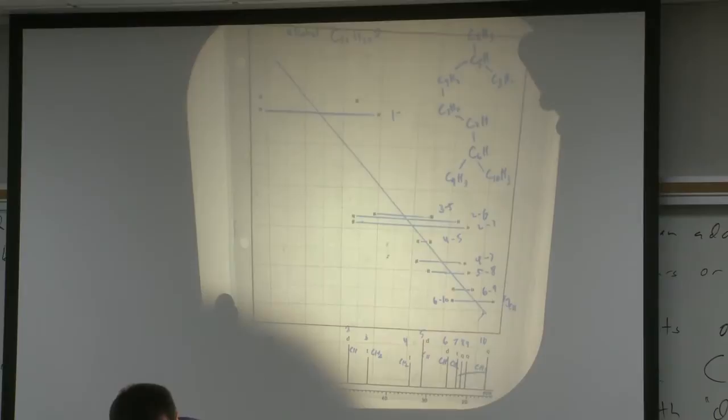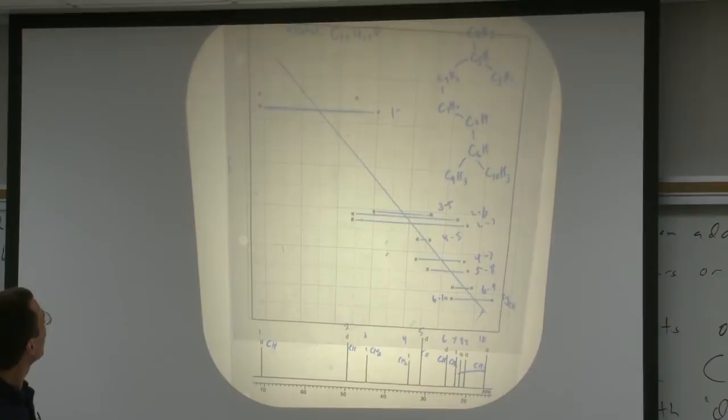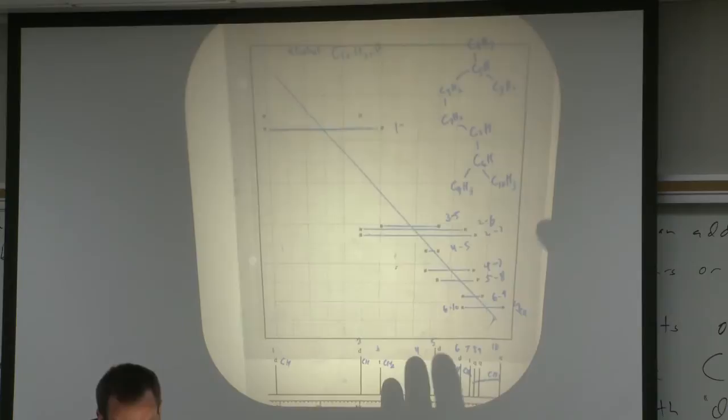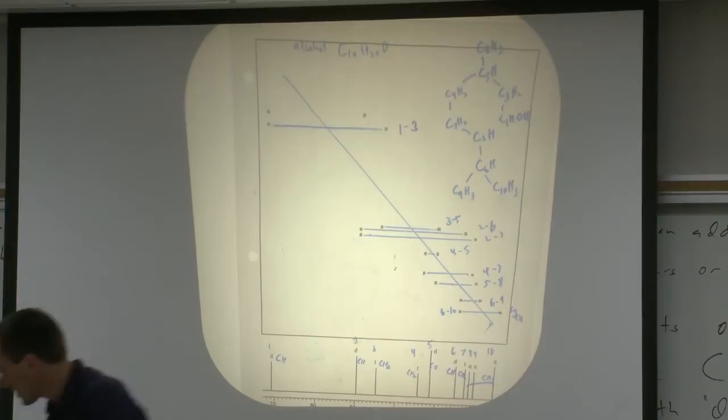It's hard staring into this thing, so let me slap a grid on this. If you look at the grid lines, they look like they line up. I think I put the grid on the axis here. I think everything's pairing up. They look like they're pretty well lined up. All right, so 1 to 3. Now one is the one that has to bear the alcohol. So C1H, that has to be the one with the OH on it. And our last one here is 1 to 2.